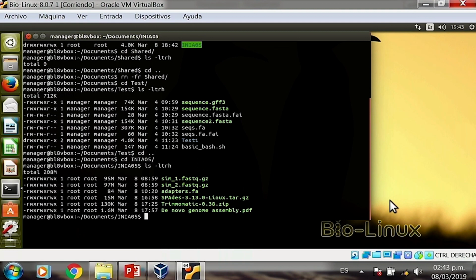So basically what you've got here is 4 main files. The first 2 are reads. It's what you would get if you get something sequenced on an Illumina machine. If you want to take a look at what it looks like when you get a sequencing result from a sequencing provider, do you see those files that say sim_1.fastq.gz? Those are what we call FASTQ files. Those are sequences.